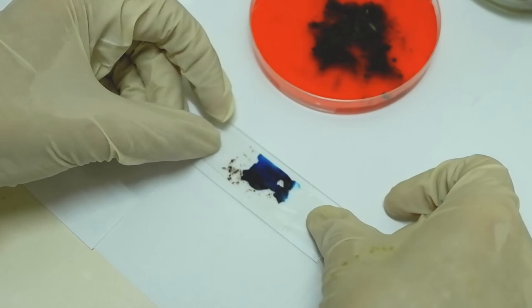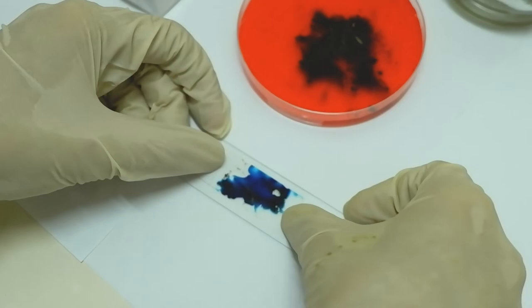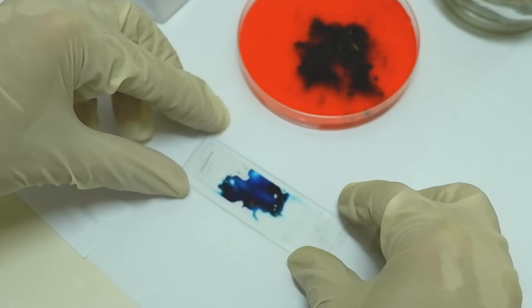Now place the tape sticky side down on the sterile slide over the lacto phenol cotton blue stain. While stretching the tape, press both ends of the tape to attach it firmly to the slide.